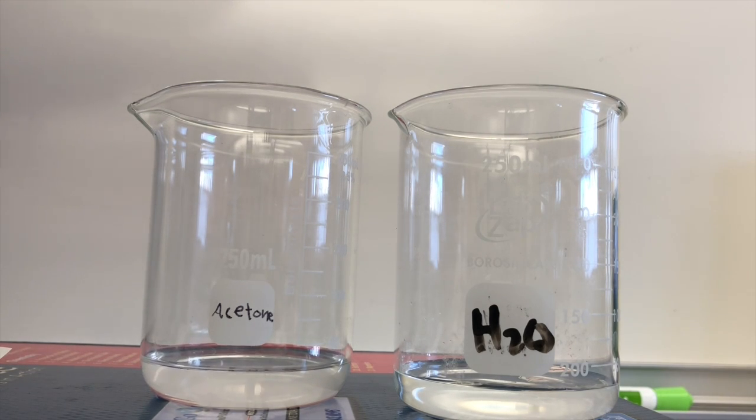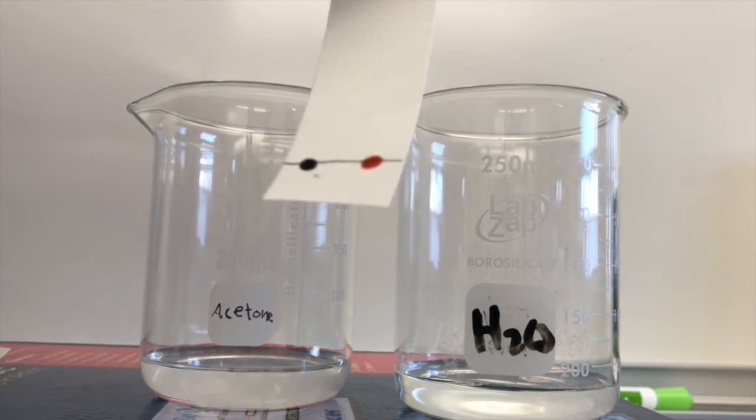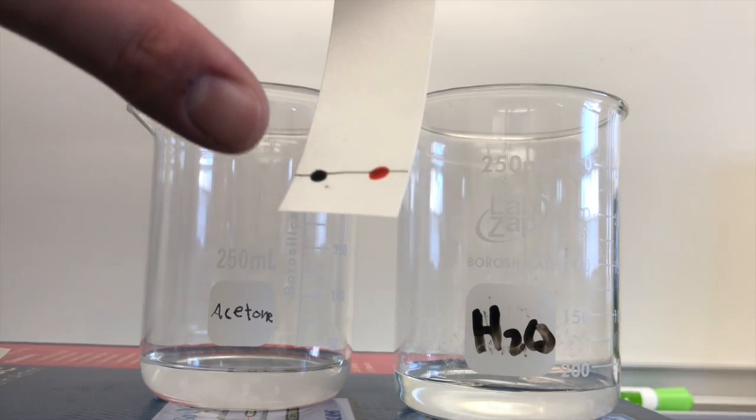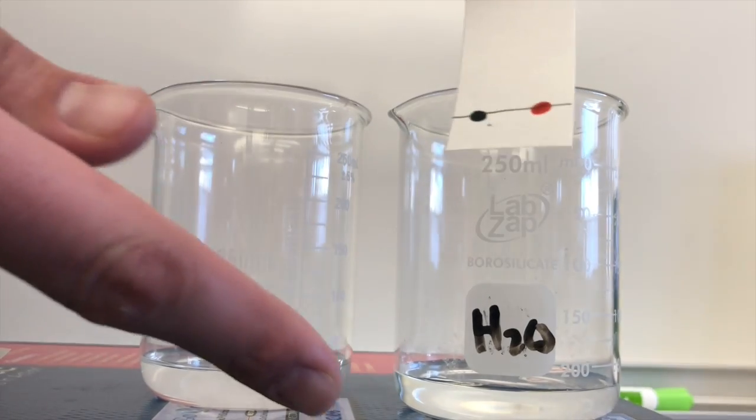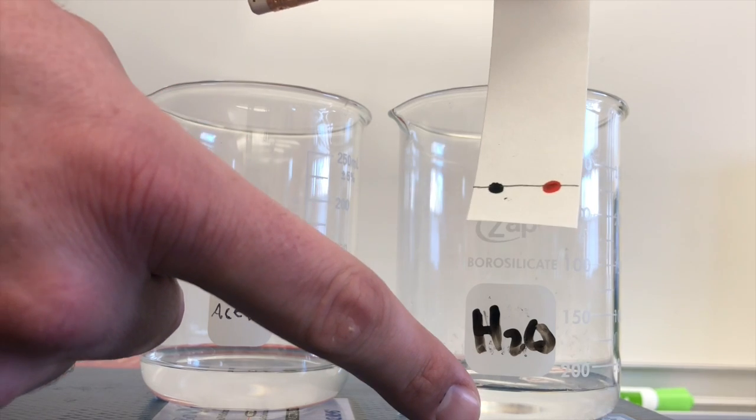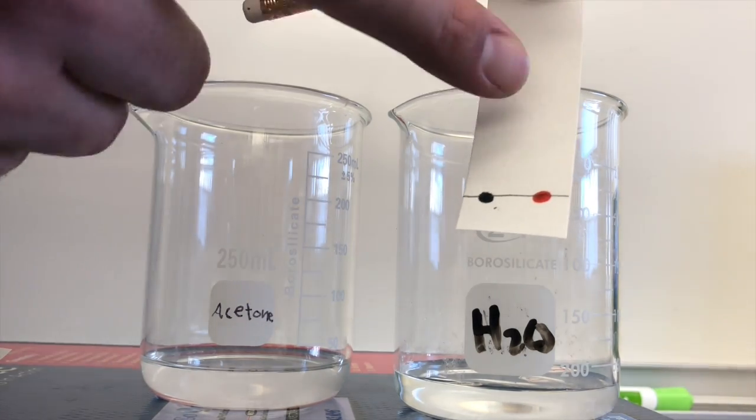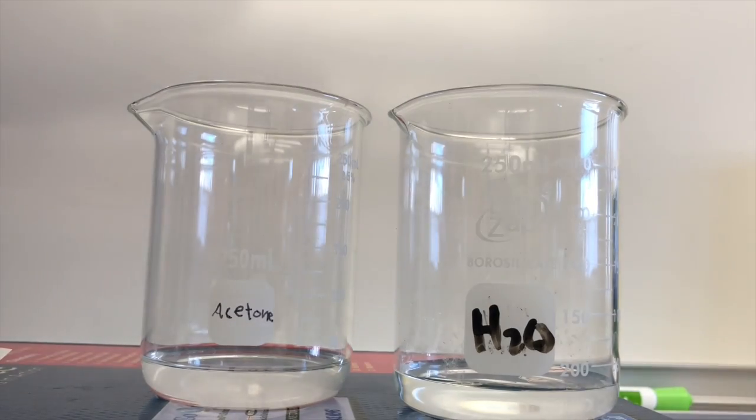One of our phrases we use is like dissolves like so if the washable marker gets dissolved and pulled up the paper that means that it's the same polarity as the liquid. What I mean by that is if the water pulls up the washable that tells you the washable is polar. If it doesn't then it tells you that the washable must be nonpolar.